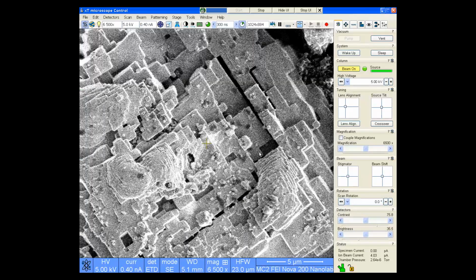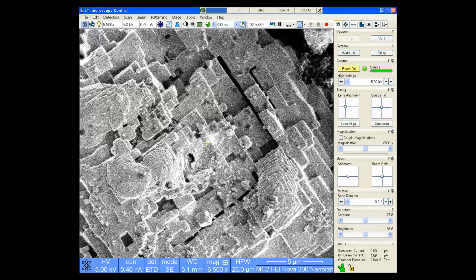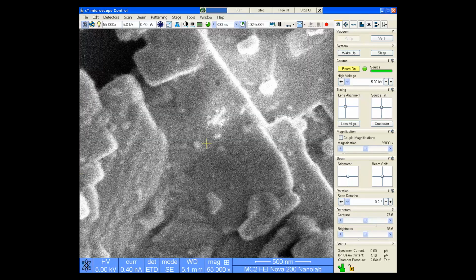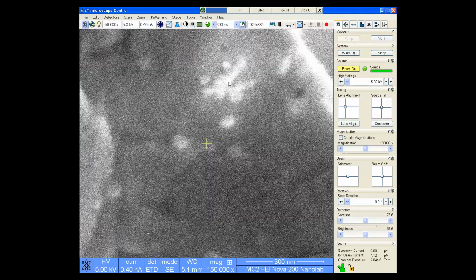So what we should do now is let's take a look at how to activate the high resolution objective lens. As I mentioned, our current conditions with the SEM do not allow us to easily see these small features. We can turn off the low resolution objective lens and enable the high resolution objective lens, which will give us much, much better clarity on these small features. The way to change the lens modes is by using this icon up here in the toolbar. Now, if I simply click on the icon, it will switch to the high resolution objective lens.